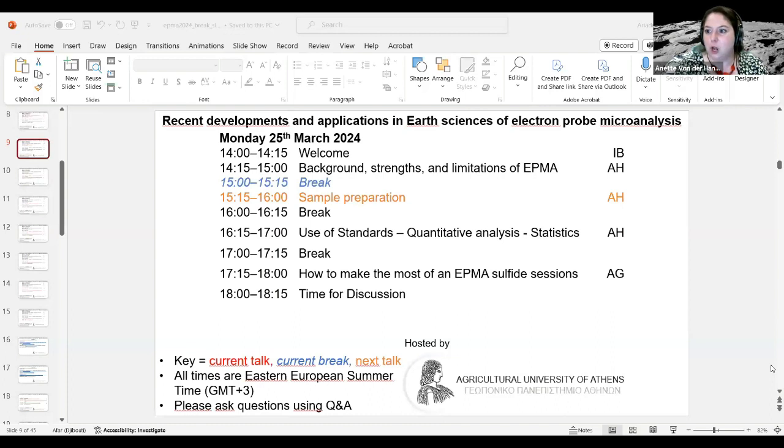What I do in general with restandardization, again, there are certain X-ray lines, not so much elements, that are kind of the canary in the coal mine. So it's not that if I restandardize, I necessarily restandardize all elements on the various spectrometers, but if I do it interactively, I usually restandardize the silicon, because that's a fairly sharp peak, and it's probably in earth science applications the most important one, makes up 50% of the element abundance.